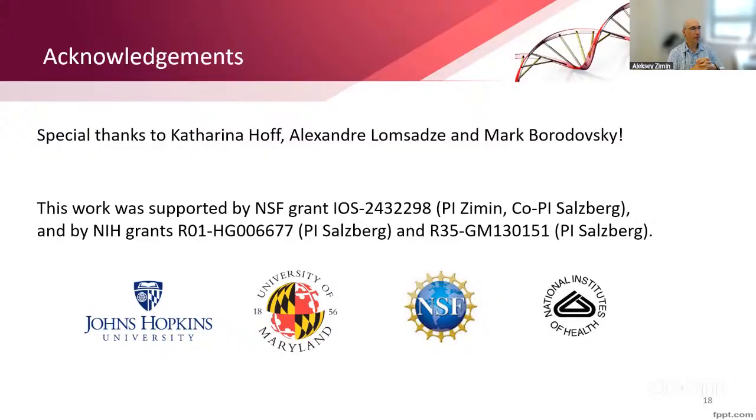Another question from Jack Tierney. Is EviAnn limited to use on an organism that uses the standard genetic code? For now, EviAnn only supports the standard eukaryotic genetic code and the mitochondrial and chloroplast genetic codes. Because typically, when you assemble a genome, you assemble mitochondria.